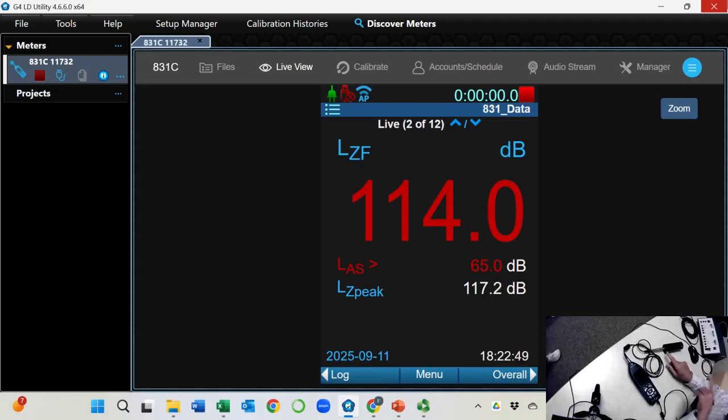One thing is I cannot hear the sound, which is good. You don't want to hear the sound when it's sealed. If I can hear the sound, it's bad. That means it's not sealed. Am I making sense? The sound is leaking. So I cannot hear the sound, which means there's no leak, which is good. And it reads, okay. I wish it was okay.